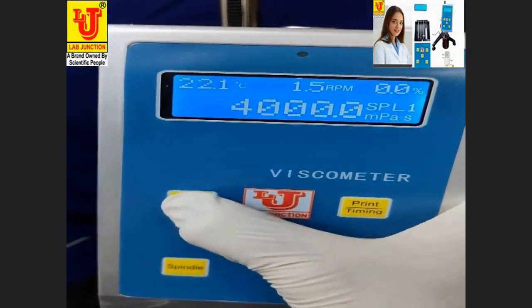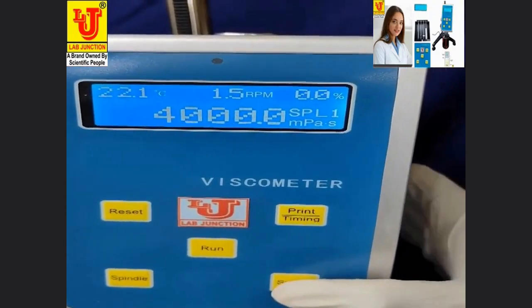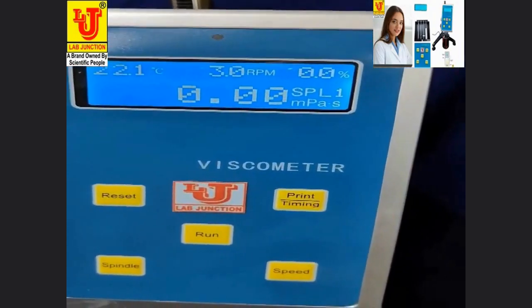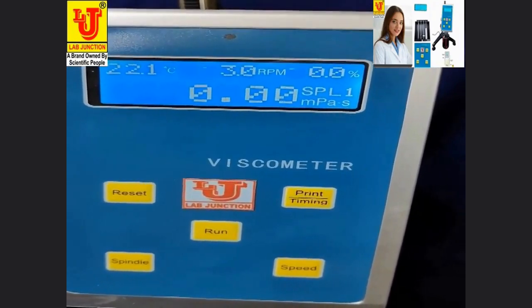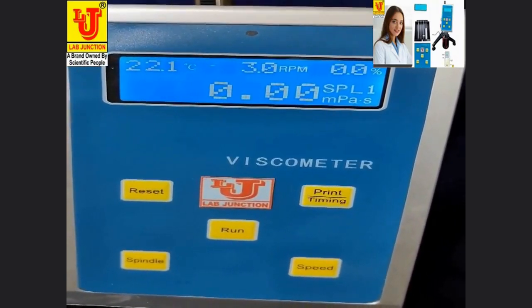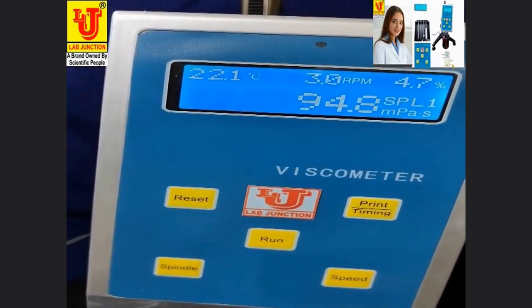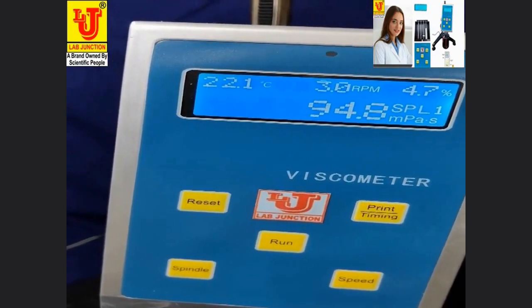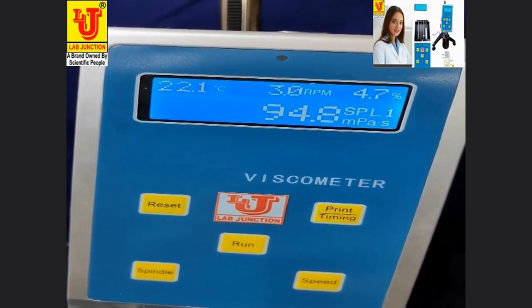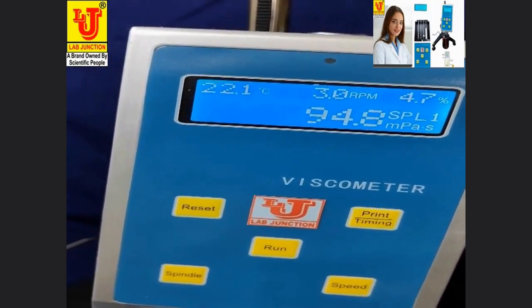Again resetting the instrument and setting speed to 3 RPM and pressing run. At 3 RPM, my MPA is 94.8 and torque is 4.7% at 22.1 degrees centigrade.